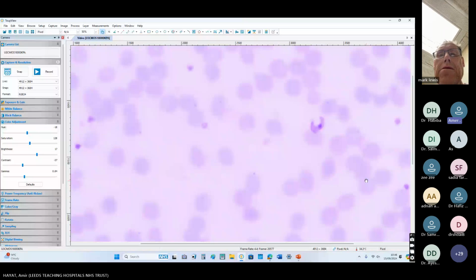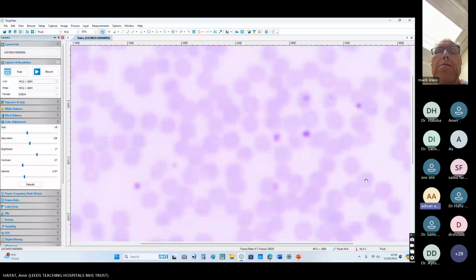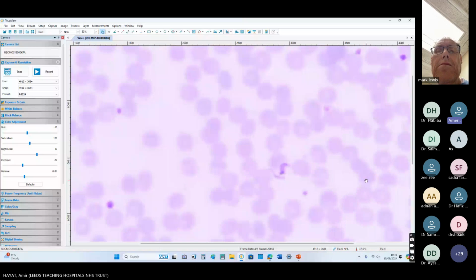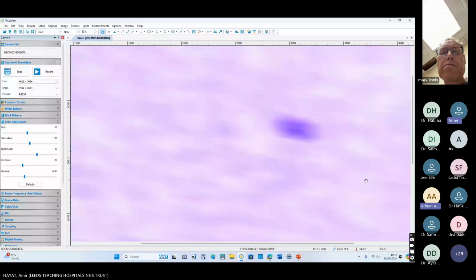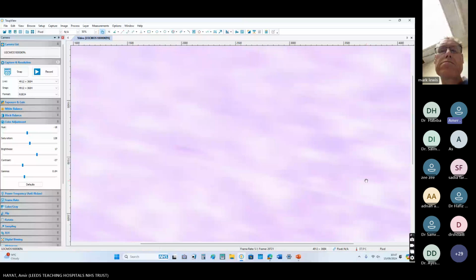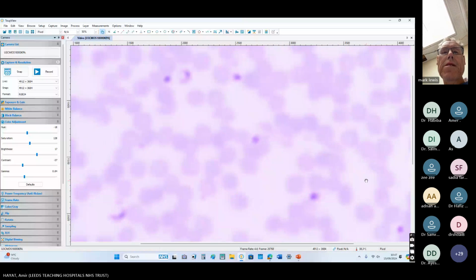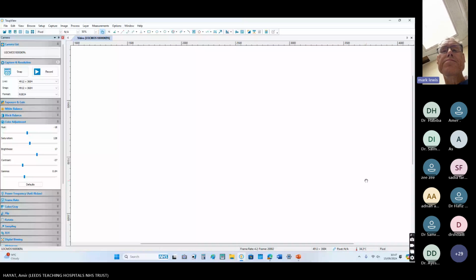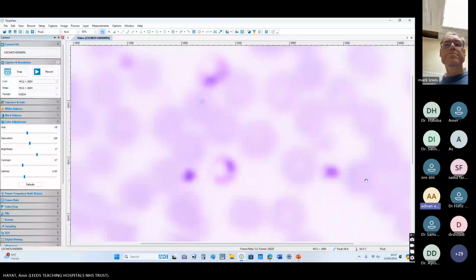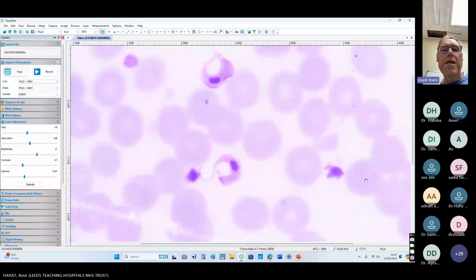What did you say? Did you say cruzi? Cruzi, yeah. Another one, but there is some artifact. Kinetoplast is quite clear, isn't it? Yes. Let's see if we have any other one. This one maybe. These two. And make it big. That's the infection. Wow. See the tail. So these are Trypanosoma cruzi.